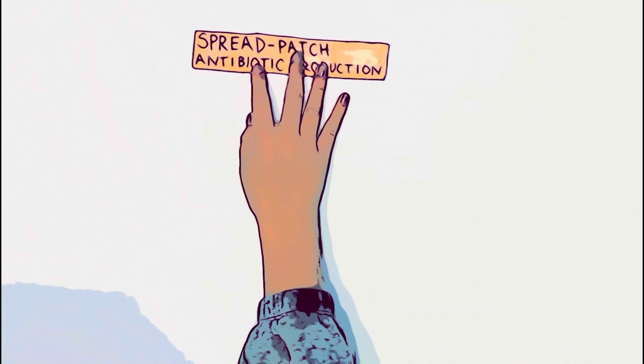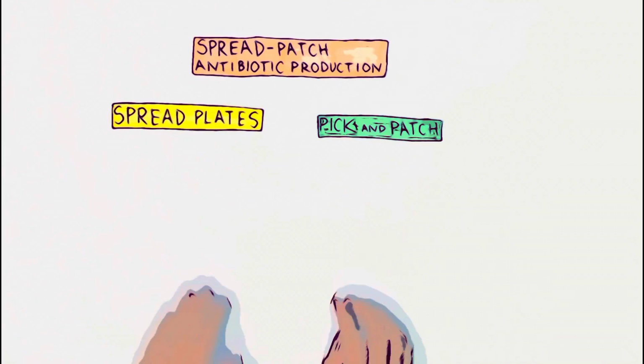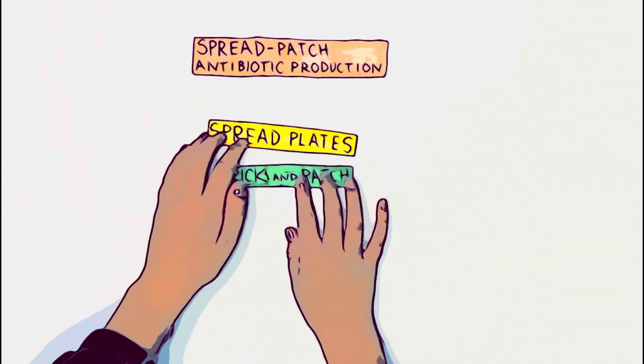Next is the spread patch antibiotic production test. This uses the spread plate method and the pick and patch plate method together in order to test bacteria against a pathogen.